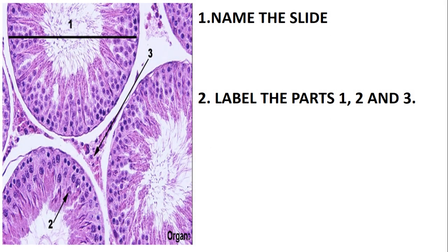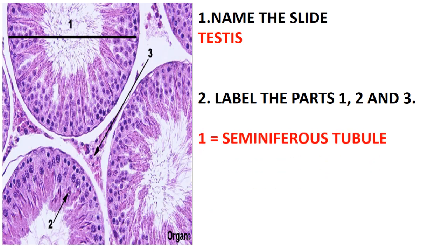The first question is: name the slide. We have been given this slide, and if you look at it, this slide is simply the testis. Label the parts marked one, two, and three. Part one is simply the seminiferous tubule — you can see it runs from here to there. This one is a seminiferous tubule, and that one is also a seminiferous tubule.